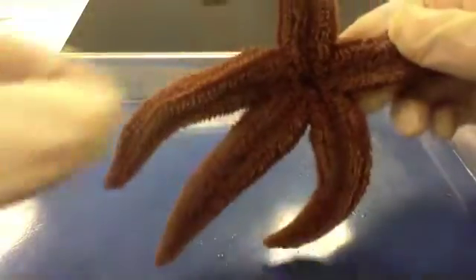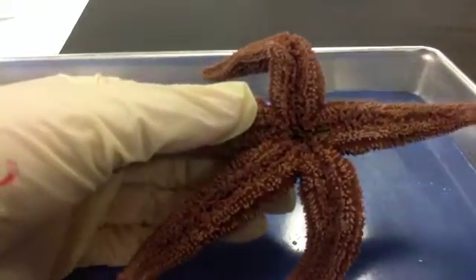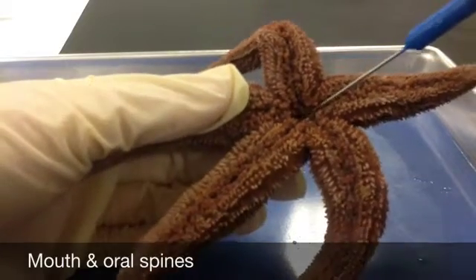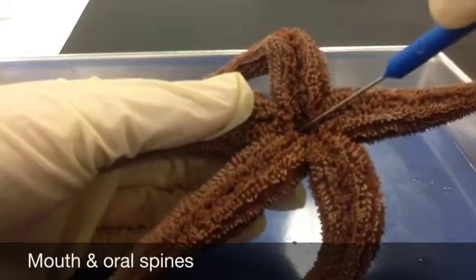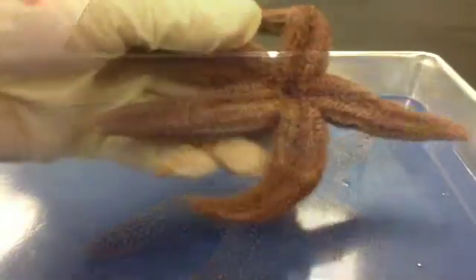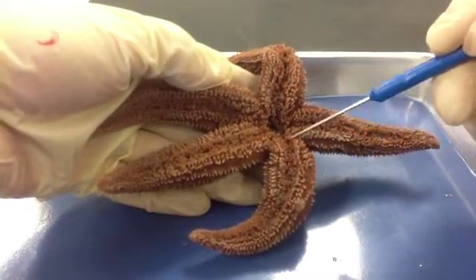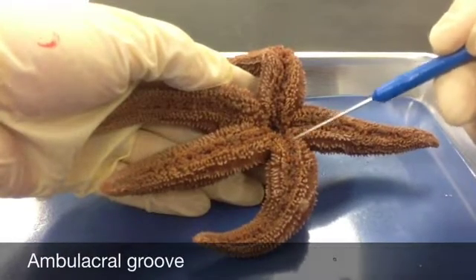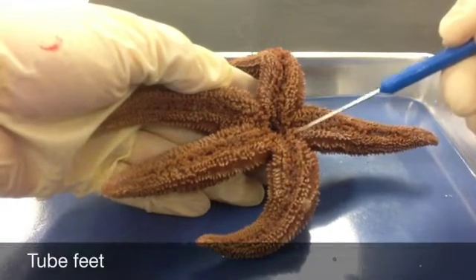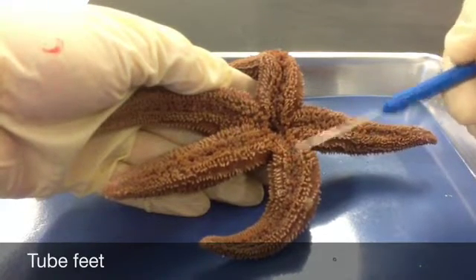Now we're going to turn the sea star over to its ventral or oral surface, which is its underside, and locate the mouth in the center of the central disc, right here. If you look closely, you can find the ring of oral spines surrounding the mouth — they're a little bit tough if you touch them. Another thing to look at is the groove extending down the underside of each arm, called the ambulacral groove. We also have numerous little tube feet, which are part of the water vascular system and help with movement and feeding.